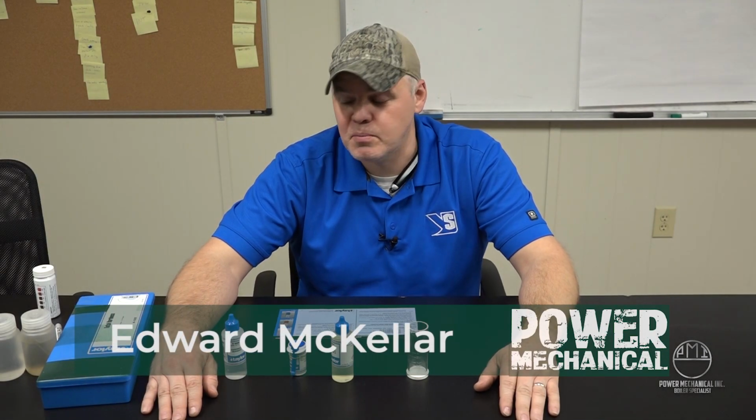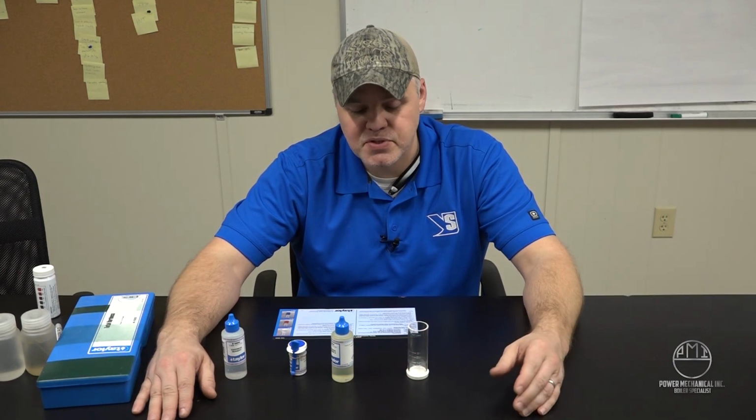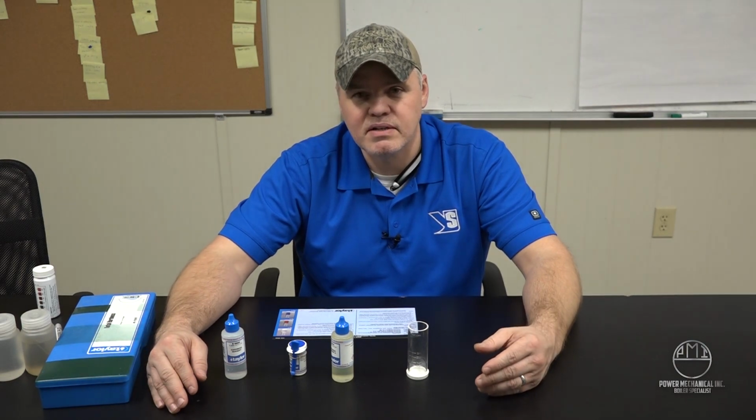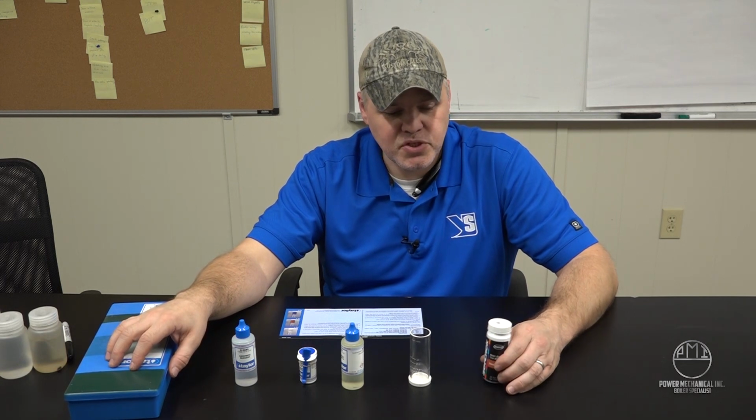Want to give you a quick tip for your boiler rooms. As we've talked about before, water quality is essential for your boilers, and today we're going to look at some hardness tests, and that way you can get a good indication of if you have some impurities in your boiler water.